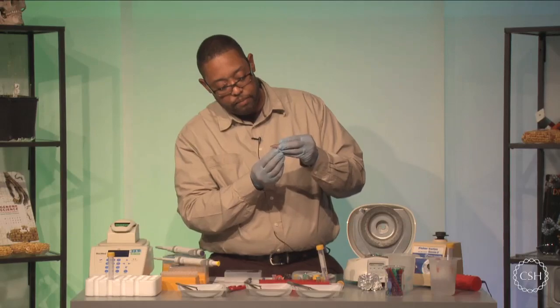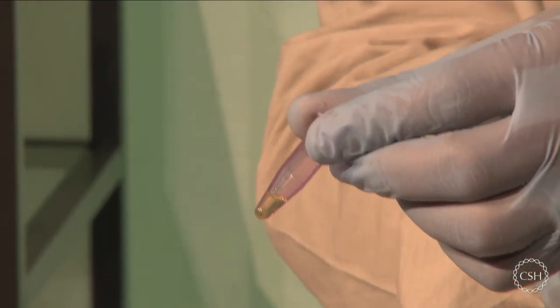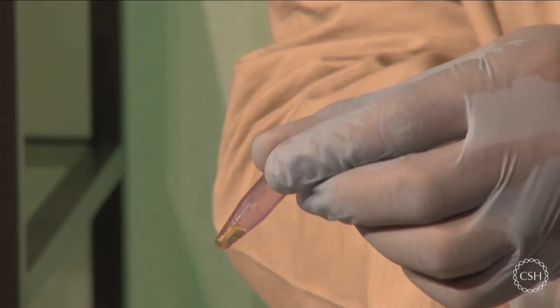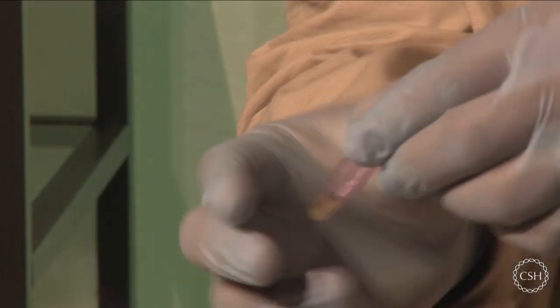So as you can see here, I have my silica resin at the bottom. It does have a little bit of green in there, but that's okay. But I want to make sure that that pellet, which is at the bottom of my test tube, is going to be void of the supernatant. So I'm going to take this out of there.